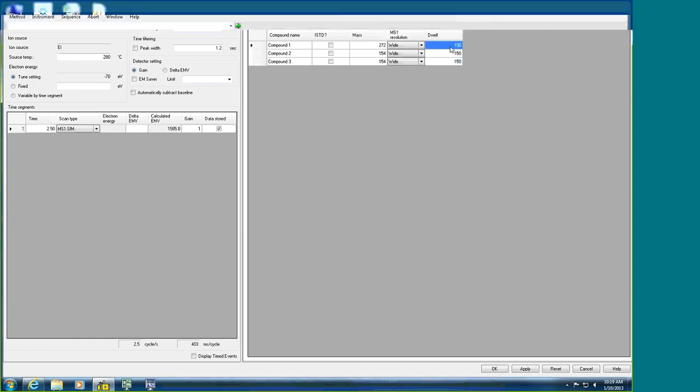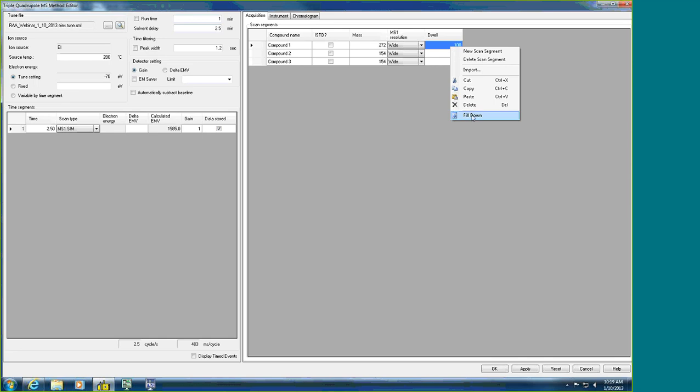So I go ahead and fill down here, and now it's 3.3 cycles per second. So typically, you have 2 choices between 3 and 5 cycles per second. Some of my colleagues use the equivalent of around 300 milliseconds per cycle. So either or, you have options, but that's typically a good rule to follow, a good guideline. Again, nothing is set in stone. It's just best practices.